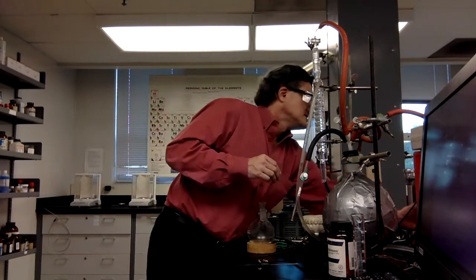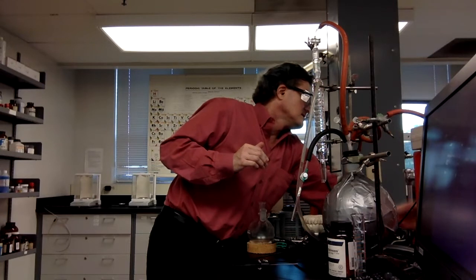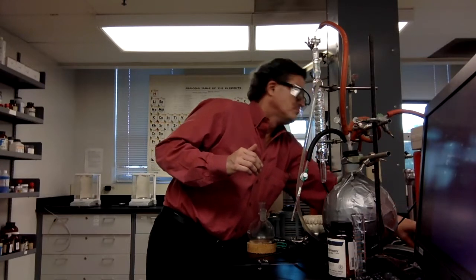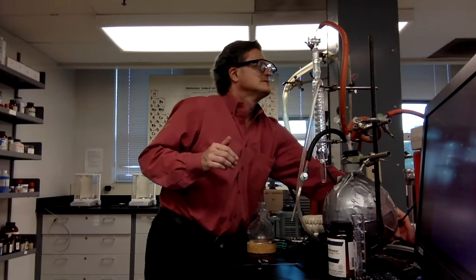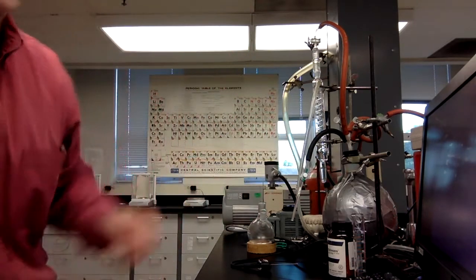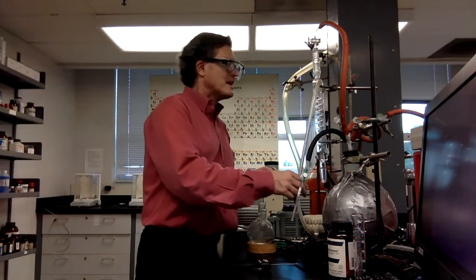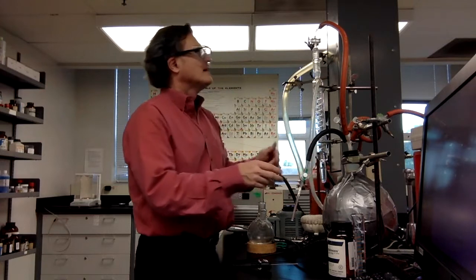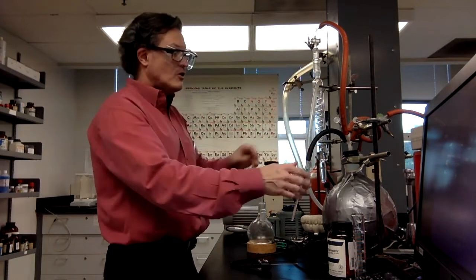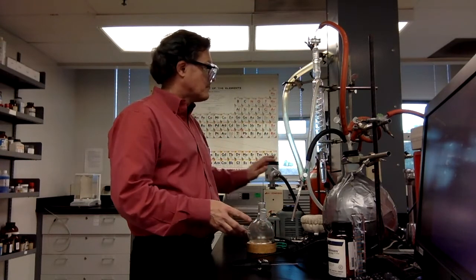We just need to drain the condenser. Boom. And you will see, there it goes. Oh, it's a cool one on this one. See, it's got the little windy one there. It's really nice. Okay, so that way we can get rid of the water out of there. It's all going to be cleaned up. We leave the pump off.